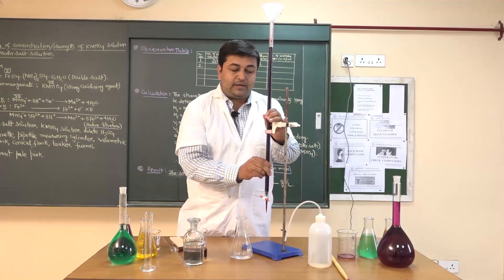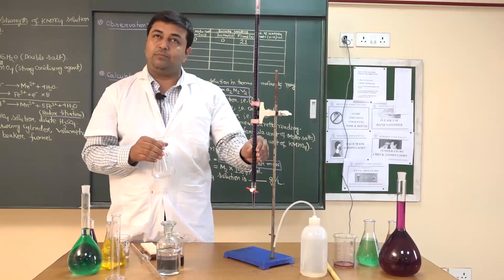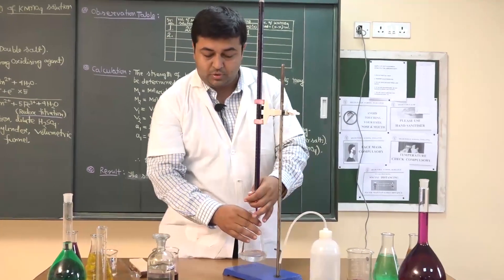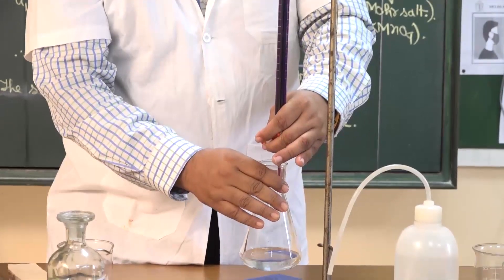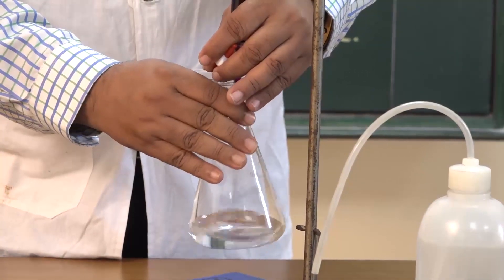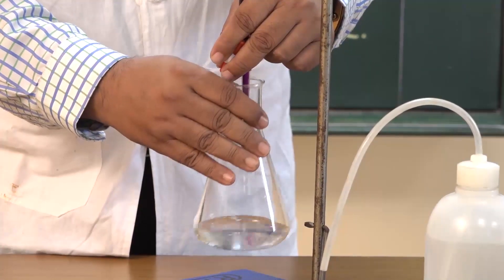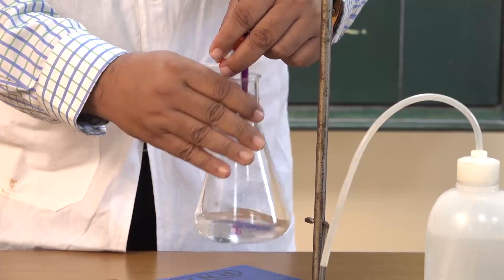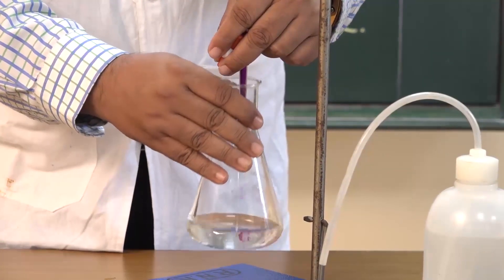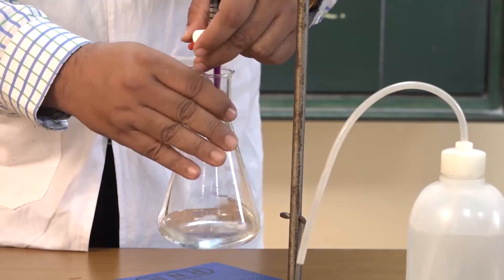During titration, using my right hand I will hold the conical flask, and using my left hand I will control the knob of the burette. Using my right hand I will continuously shake the solution to make it homogeneous. I am adding KMnO4 drop by drop. The color is vanishing — meaning the Fe2+ ion is oxidized to Fe3+ ion in Mohr's salt, and the permanganate (Mn7+) is reduced to Mn2+ state. That is why the pink color is vanishing.